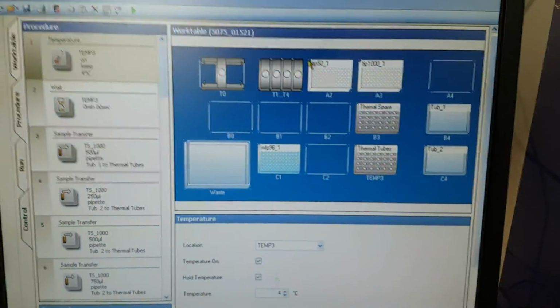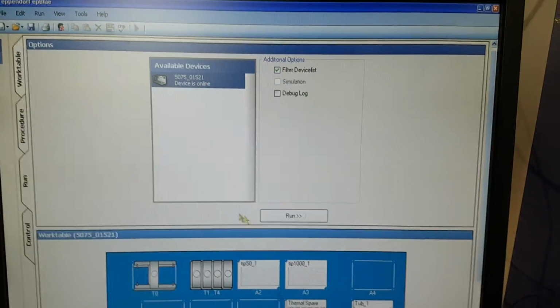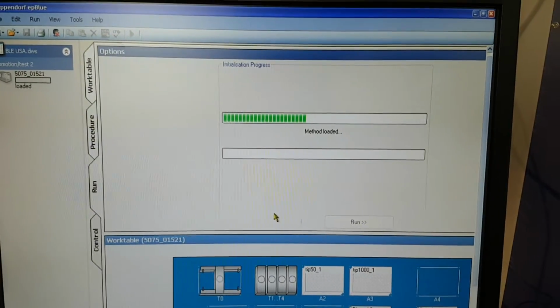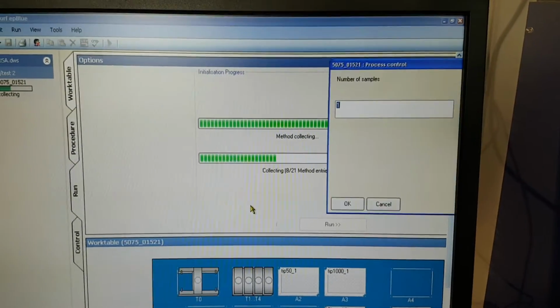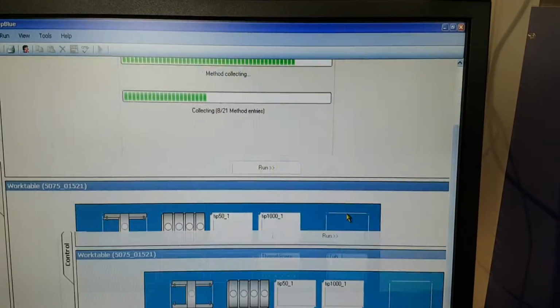You see that the deck setup is the same. And we're going to start the method. So it's asking us if we want to run. We do. It's loading the method. Asking for the number of samples. We've only got one.